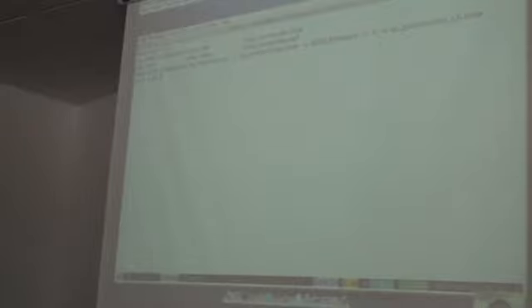Okay. So now we actually have our predictions. Yay, they're in BIOM format. And you can take these functional predictions and use them with lots of different tools, just like you would if you actually did shotgun metagenomics and were going to use that data in table format. So you can put these back into QIIME and do things with QIIME. You can convert these to a tab-delimited file and do whatever your preference is, I guess.